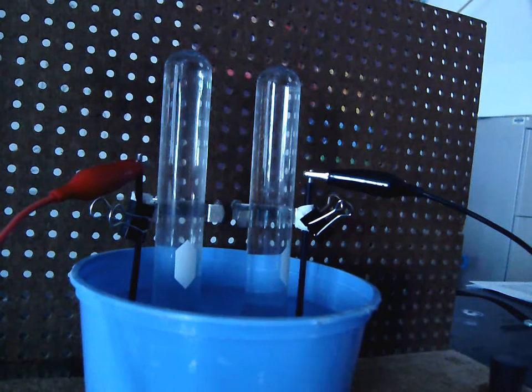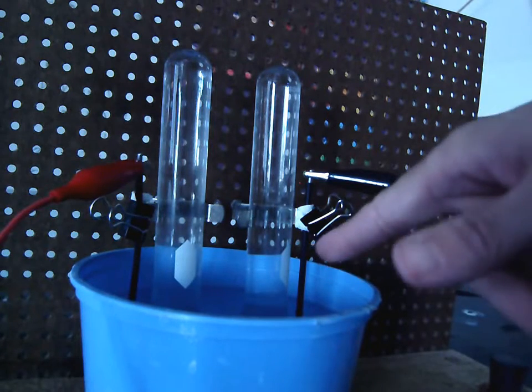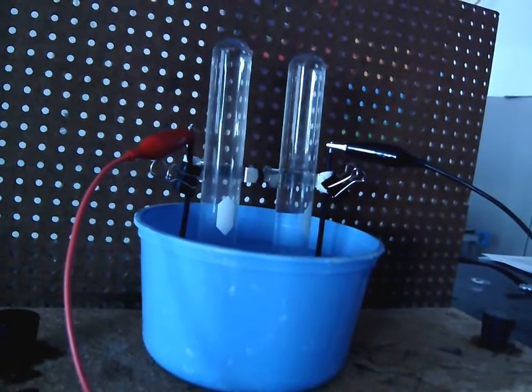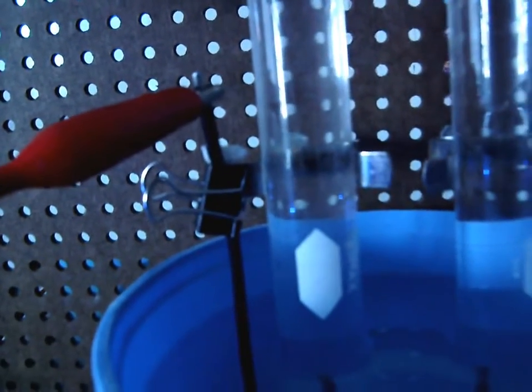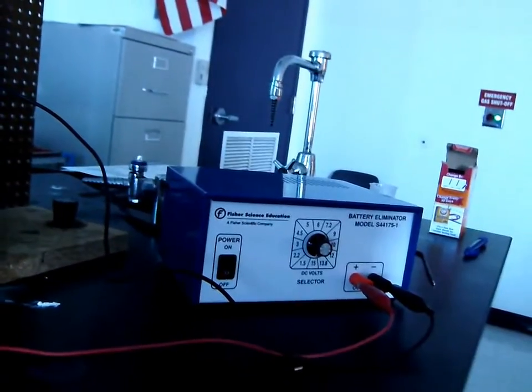Okay, so we have 2 test tubes full of water, the bucket with some water. We've got 2 electrodes with the end directly underneath the mouth of each of the 2 test tubes. Then what we have is we've got a red cord and a black cord, and they're little alligator clips that are attached to the top of each of the electrodes. I don't know if you can see that in there like that. So there's one clip on that electrode, and there's one there. Okay, they kind of look like jumper cables if you've ever seen that. And then the other end is hooked up over here.